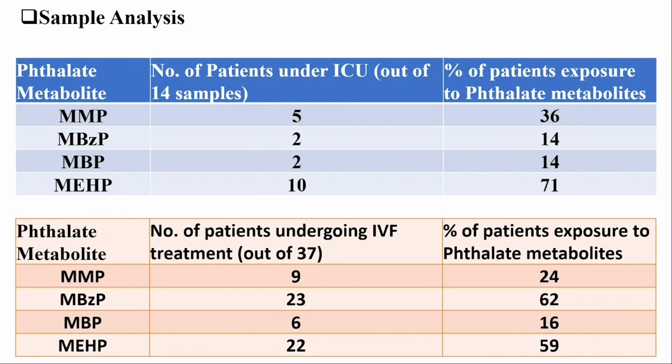So it is a summary of sample analysis. In ICU, out of 14 samples, 5 samples were discovered with monomethyl, 2 with monobenzyl, and 2 with monobutyl.